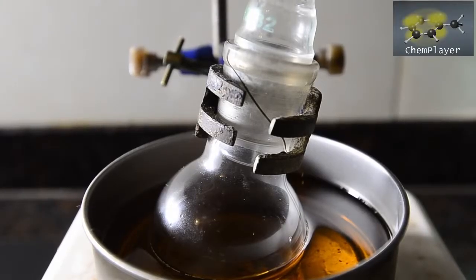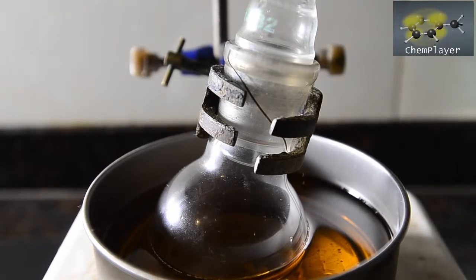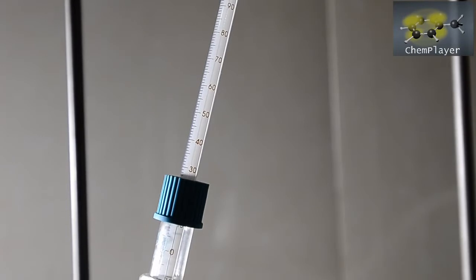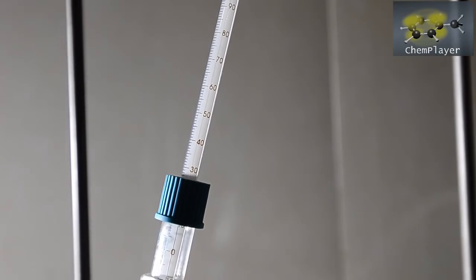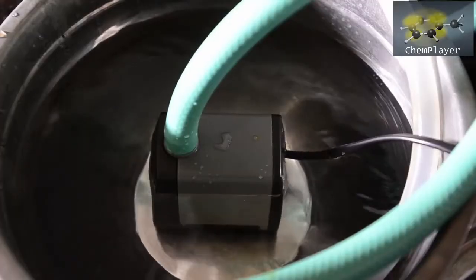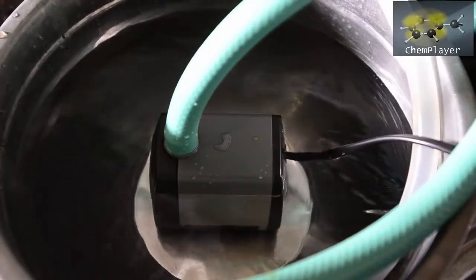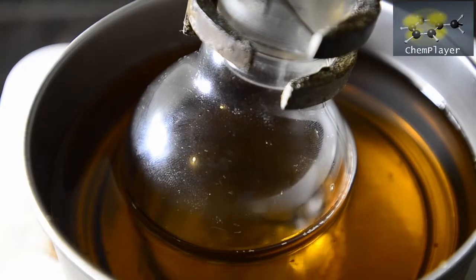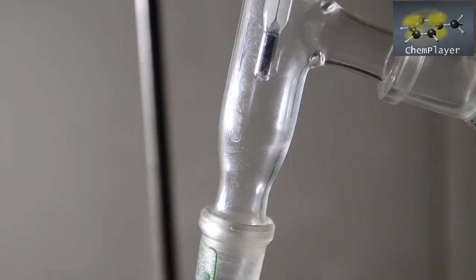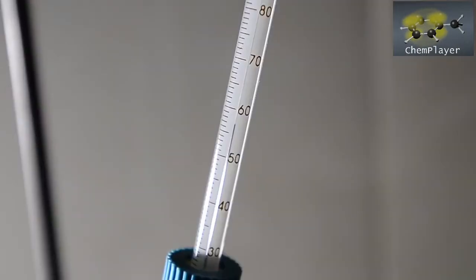We're going to use an oil bath to provide constant stable heat. And we should be able to tell what the different fractions coming off are if we record their boiling points. So let's get the heat up and see what comes off. We first get some boiling in the flask quite soon after switching on the heat. And a colorless liquid comes off and condenses at about 60 degrees C.